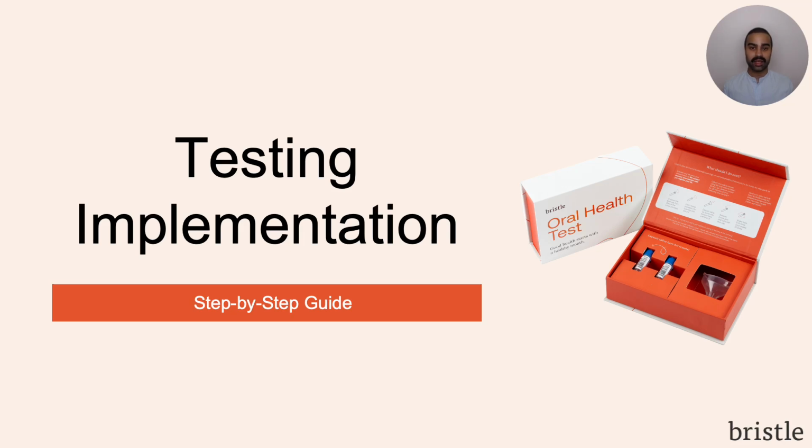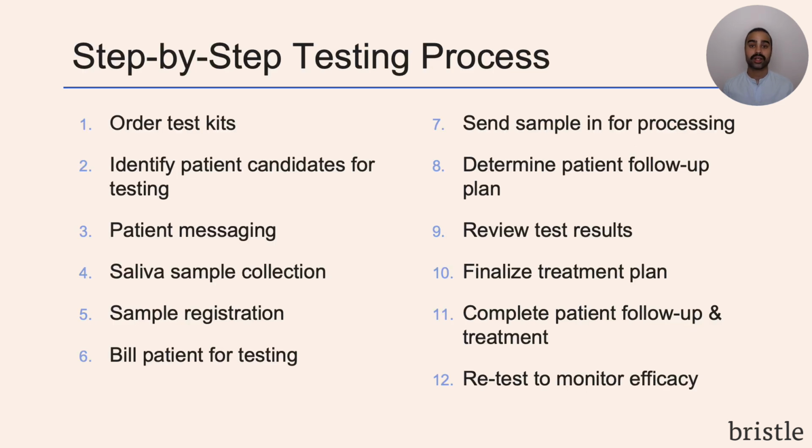Hello, I'm Shivam, and in this video, I'm going to walk you through how to implement testing in your practice step by step. We're going to cover everything from ordering kits to messaging testing to your patients, collecting saliva samples, reviewing results, and following up with patients. So let's dive into each step.